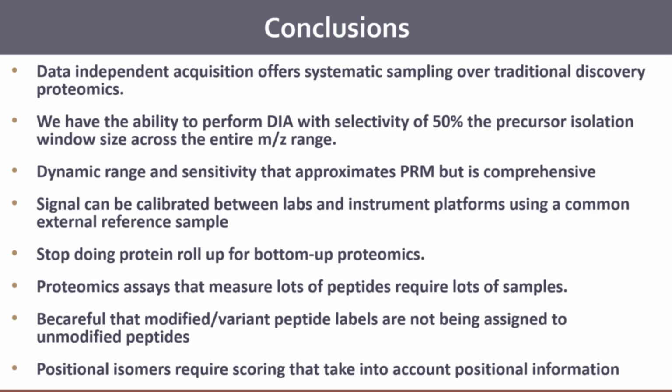So be careful that modified variant peptide labels are not being assigned to unmodified peptides and vice versa. This is definitely an area of research still. It's definitely something that I think is going to be ongoing for a bit.